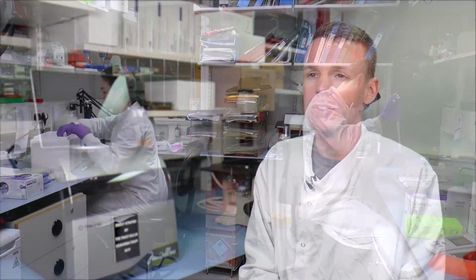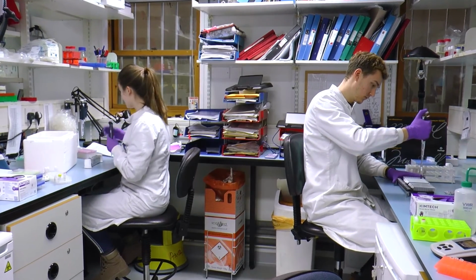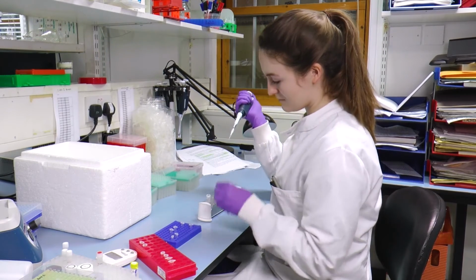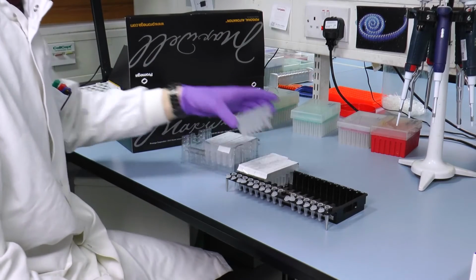My name is Thomas Turner and I am a senior postdoctoral research scientist at the Anthony Nolan Research Institute. So we currently perform HLA typing by starting off with DNA, whether this be from blood, from cell lines or from buccal swabs, and we use polymerase chain reaction with DNA barcoded primers to allow us to multiplex both samples and loci into a single sequencing reaction. So we do things at quite high throughput. And then we use Pacific Biosciences single molecule real-time or SMRT sequencing to generate the HLA sequences.